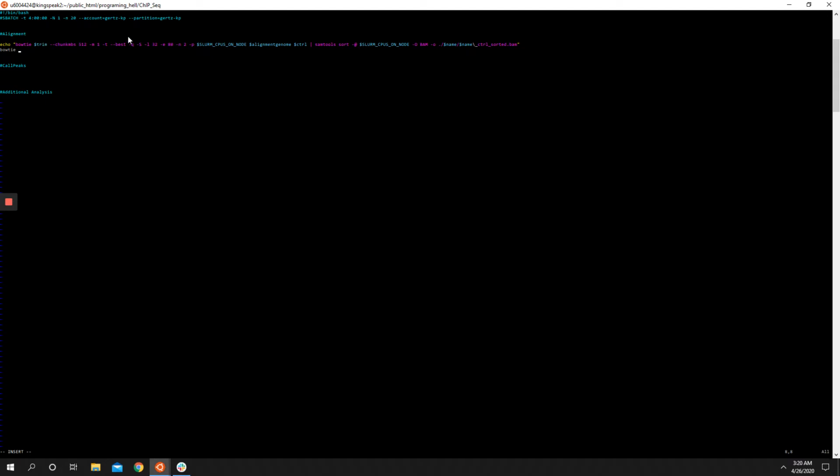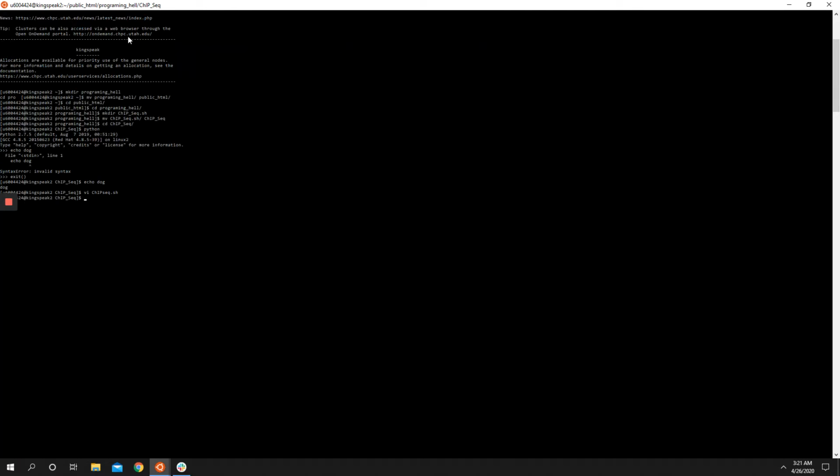So you'll see a lot of these words with a $ sign in front of them. Those are just variables. So hopefully you know what a variable is from high school math. But let's say you want to have something set that you don't want to have to type out every single time.